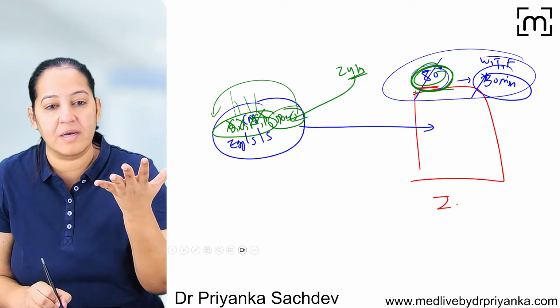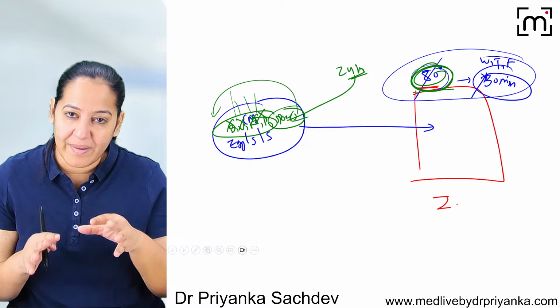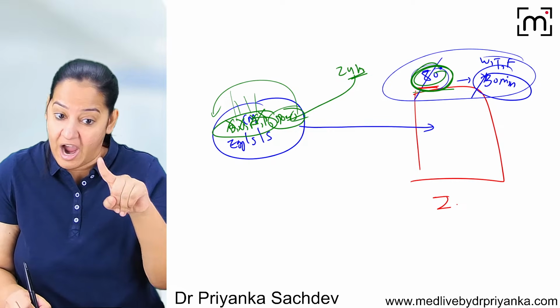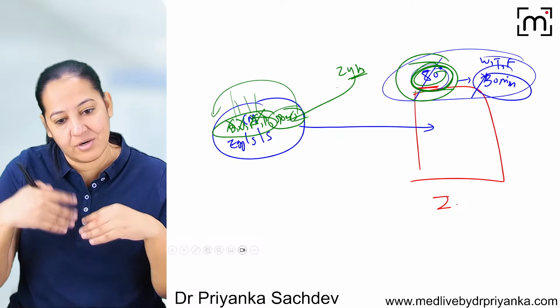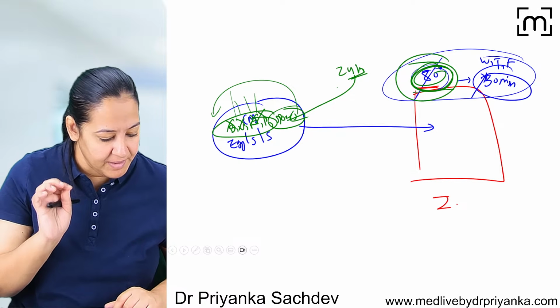So we are allowing the spores to germinate. You know, feeding the goat before slaughtering it. Got my point? The same thing. So we are allowing the spores to germinate so that we can kill them on the next day. We are asking the spore to germinate. It converts into bacteria. The next day, after 24 hours, again we are heating at 80 degree for half an hour. So if it is converted into vegetative form, it will get killed now. And again, the third session is for any backup, if any residual is there. So this is the principle behind it.